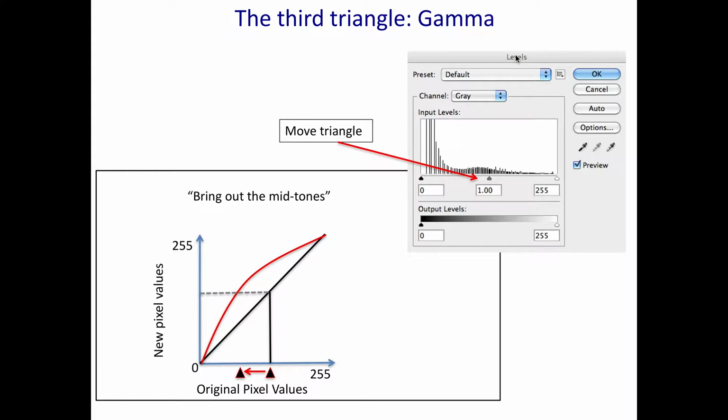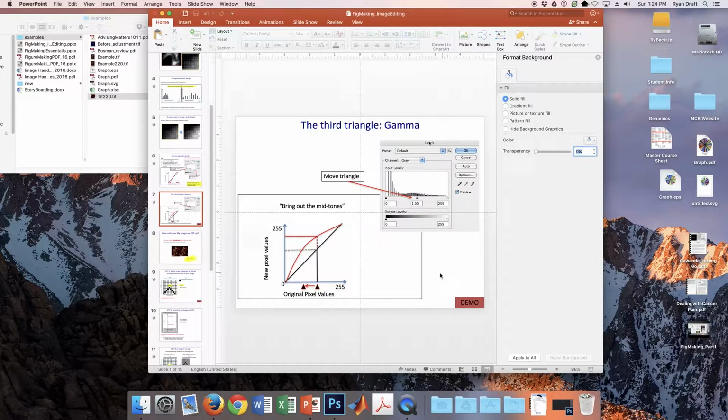And that is useful because if we have a pixel value, say, of 120, and we remap it by moving the gamma around, we can see that we can really boost the pixel level of these midtones without having much effect on those pixels that are at the ends. So we're not going to saturate or drastically alter those pixels at the 0 or at the 255, the extreme ends. We're only going to bring up those midtones. And we'll see that that ends up being really useful to help make our images look pretty bright and vibrant. So I'm just going to show you how easy this is.